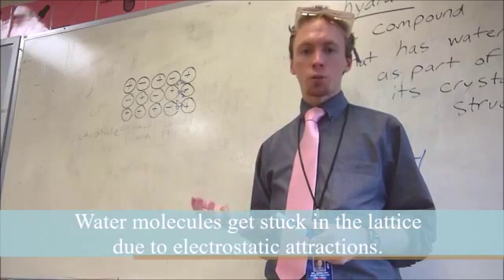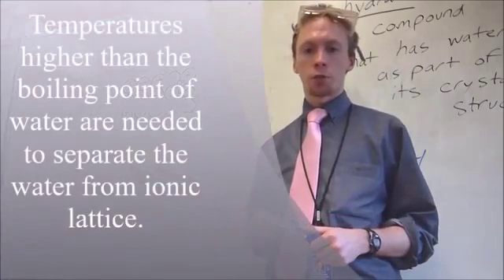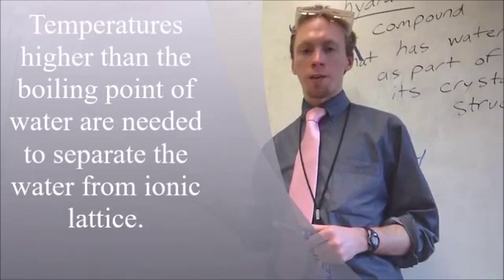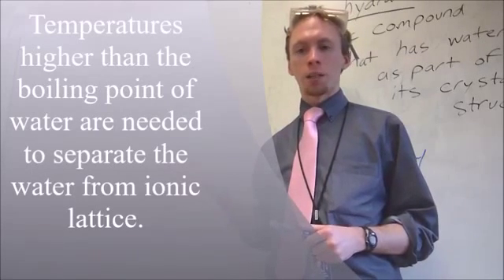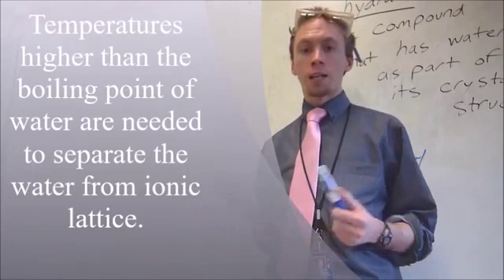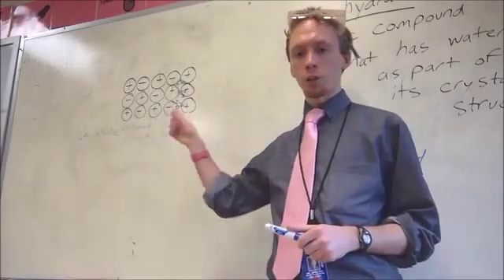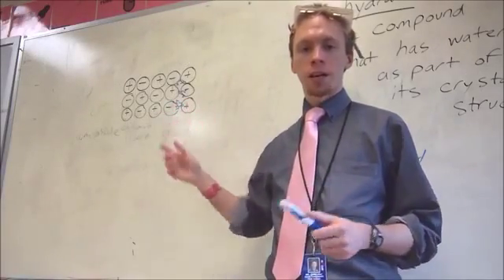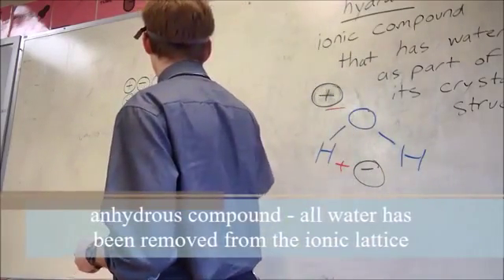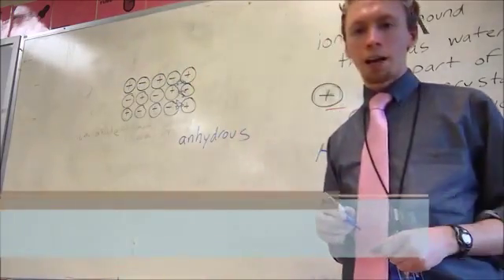And so as a result, we can't rely on the boiling point of water or just the vapor pressure from atmospheric pressure to get this water to come out. So we have to force it out by heating it to incredibly high temperatures, higher than we've done before. And so as a result, for this lab, we're going to need to use some new tools to turn our hydrate into just the standard ionic compound without water, which we call an anhydrous compound.